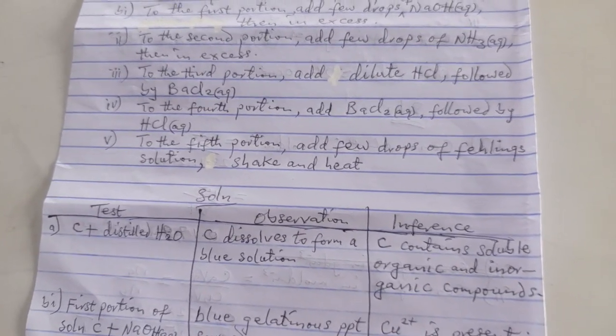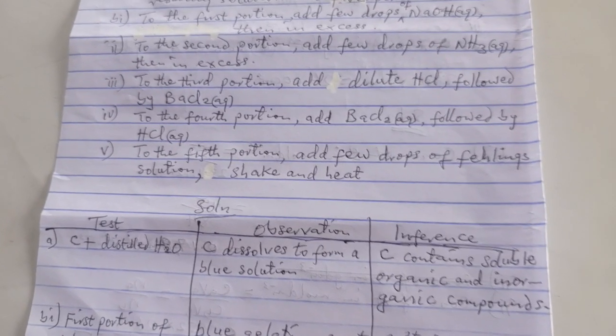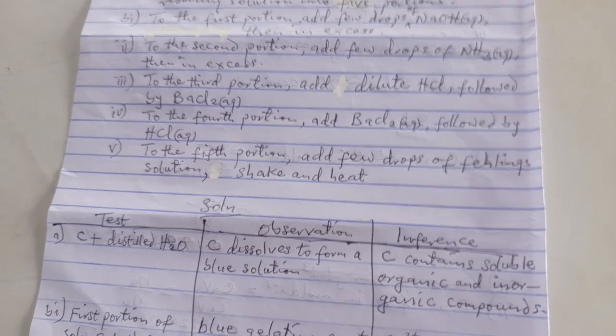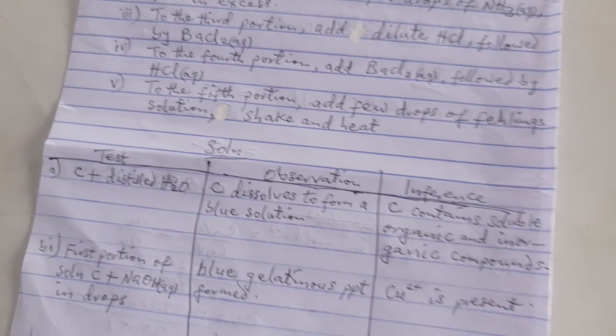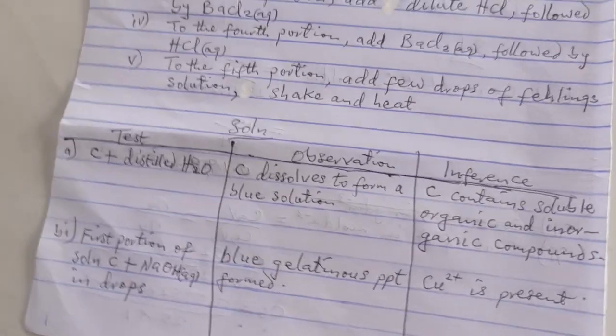Inference, you now tell them C contains soluble organic and inorganic compounds. So the two compounds are soluble because they are mixed and the C dissolved completely. So both of them are soluble.